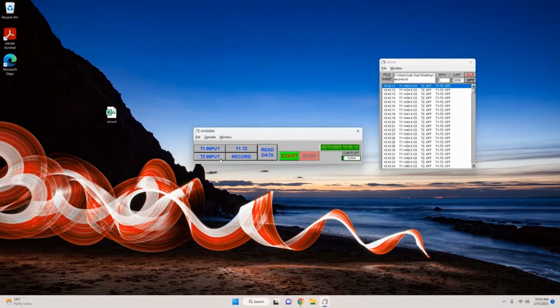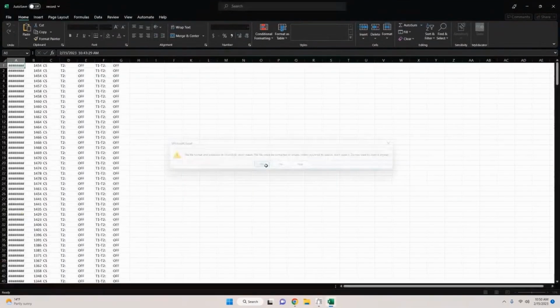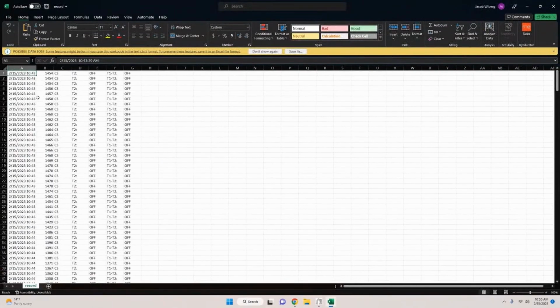At this point, you are welcome to open the Excel file of your recorded data, and you should see all the temperature values over time. After determining the phase transition temperature of this sample, complete the same steps with each individual sample to determine their phase transition temperatures. Then refer to the tin-zinc phase diagram to determine the eutectic composition of each individual sample based upon its phase transition temperature. Refer to lab documentation to know how to best report this data.